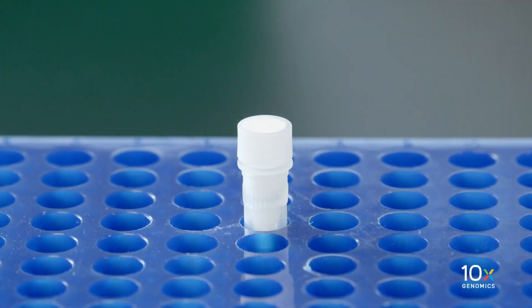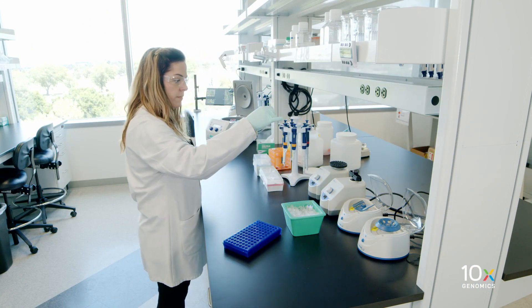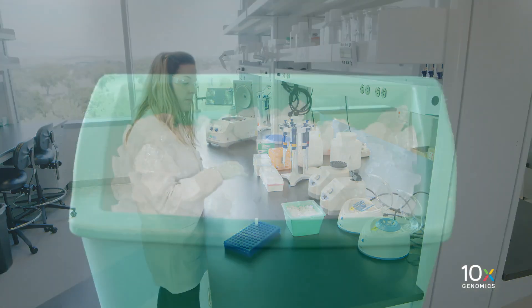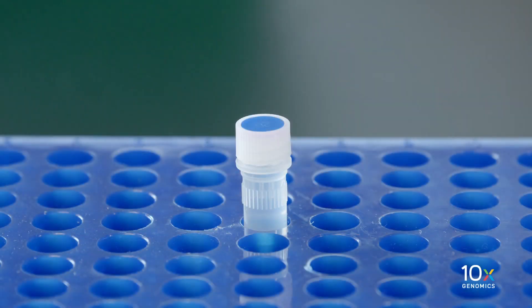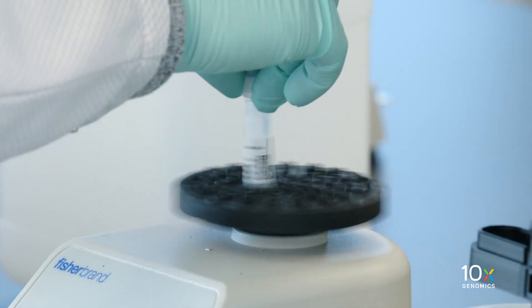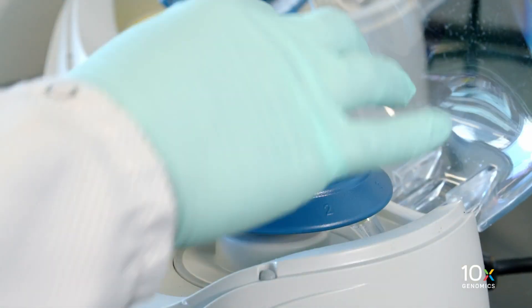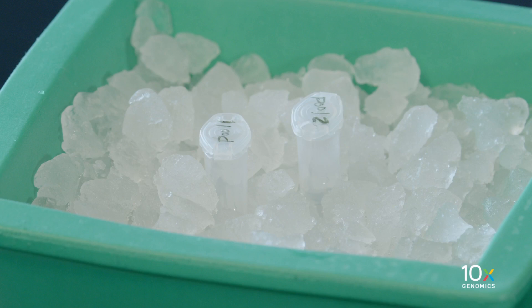We have filtered and counted the samples. Now we will prepare the GEM master mix and dilute the samples. We have reducing agent B — vortex, verify there is no precipitate, centrifuge briefly, and keep at room temperature. We have GEM enzyme mix on ice. We have GEM reagent mix thawed at room temperature — vortex, verify there is no precipitate, centrifuge briefly, and keep on ice. We have post-high resuspension buffer on ice. Finally, we have the pooled samples in 1.5 milliliter microcentrifuge tubes on ice.